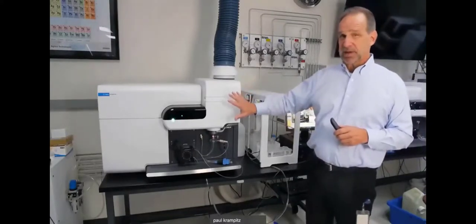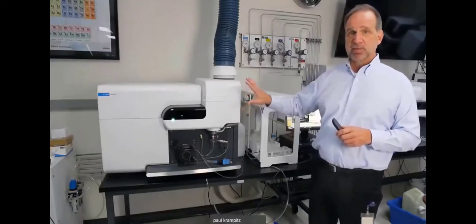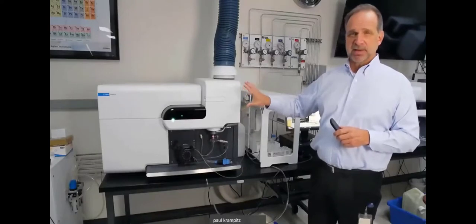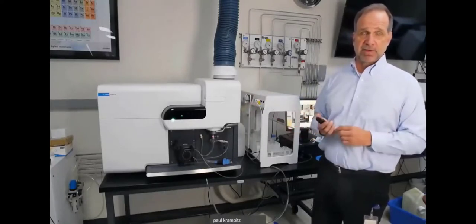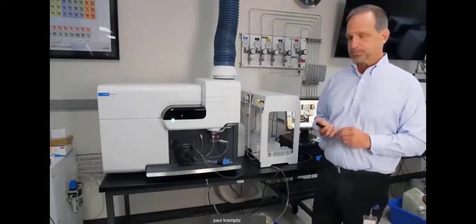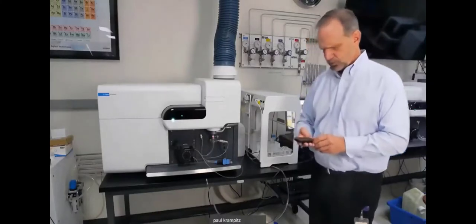It's a nitrogen-based plasma rather than an argon-based plasma, so it is going to be a little bit cooler. So you do sacrifice some detection limits on the higher IP potential elements like arsenic and selenium, but typically for wear metals and oils, you're not looking for very low levels of those, and it works very, very well for that. So let me see if I can change to one more view here.